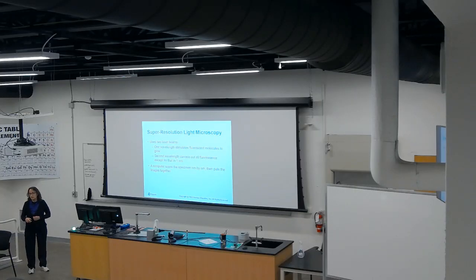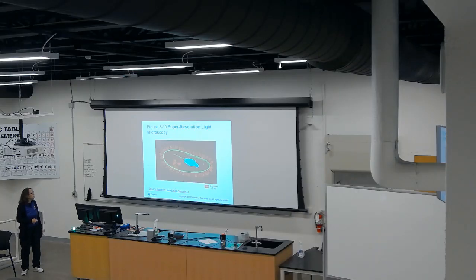So this is common for many objects that you're studying. You want to start seeing slices, the details from top to bottom, from bottom to top. So basically you're looking at the topography, and when you use this software, you can obtain really nice resolution, and then you can see what happens at different levels of these specimens. So see, this is what you can have with this super resolution light microscopy.